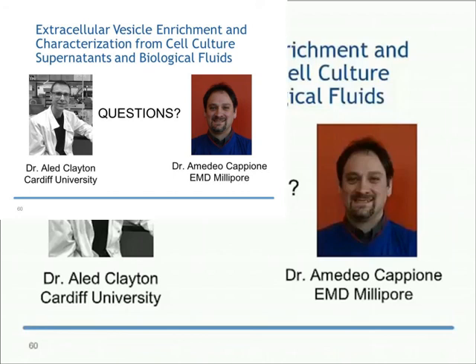We have not explored looking at our preps in any functional assay. All we've done to this point is look at what's on the surface or what's inside, either protein content or RNA content. We have done no functional assays, taking a prep that we made, labeling it or doing something with it, and then asking how well it binds or is taken up by another cell type. No, we haven't done anything along those lines as of yet.